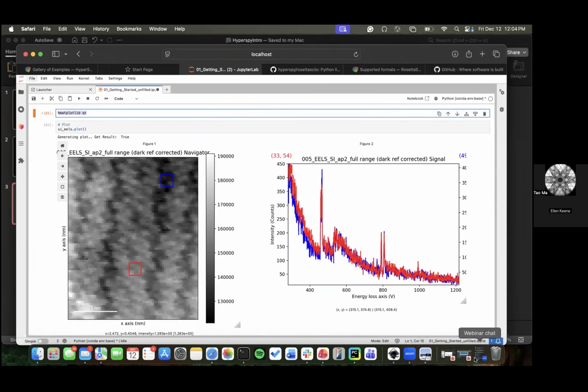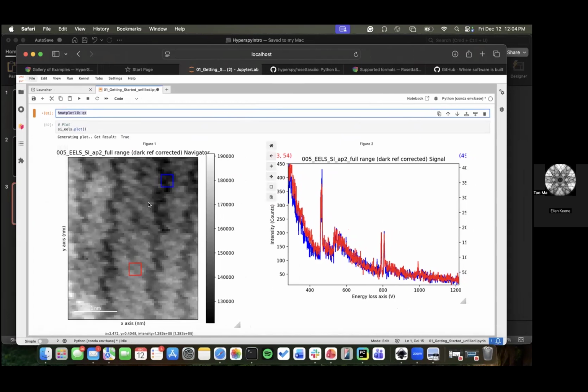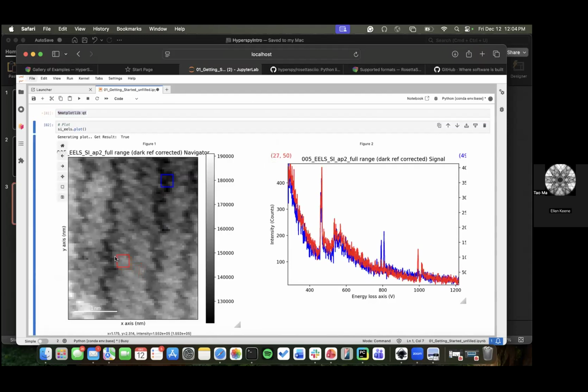So let's see what our question is: how to select multiple pointers. For these multiple pointers right here, you just click in the middle of them. What makes the extra one is E. You have to click on this plot first, and then you press E.